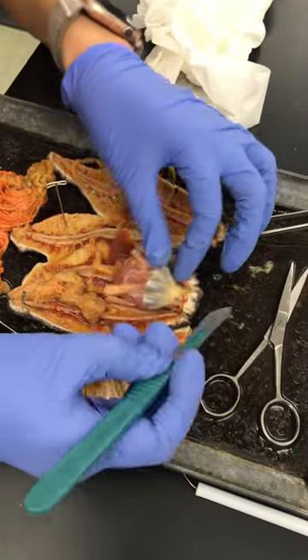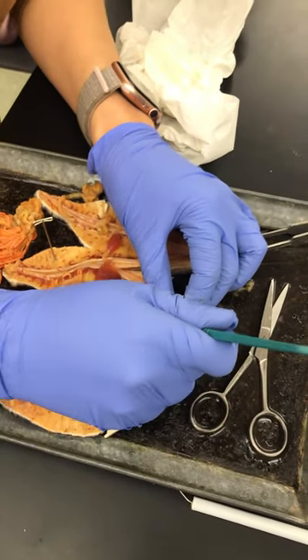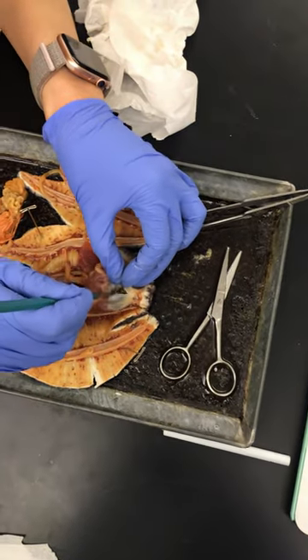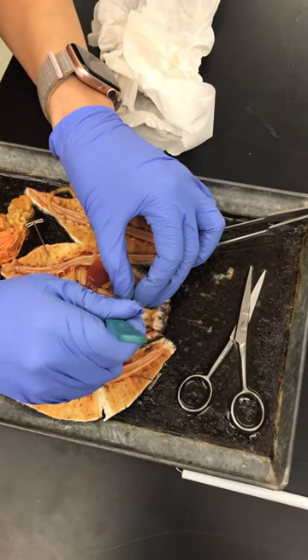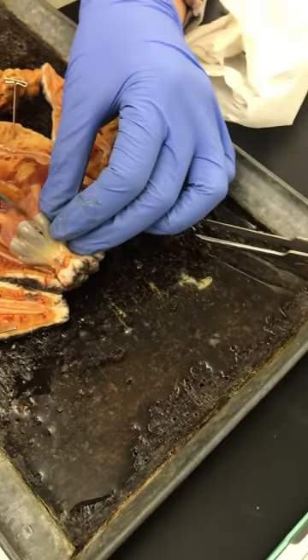Let's cut it open. Let's see what happens. I don't want it to squirt at me. These are retracted muscles — they were attached up here. Longitudinal muscles, got two feet here.